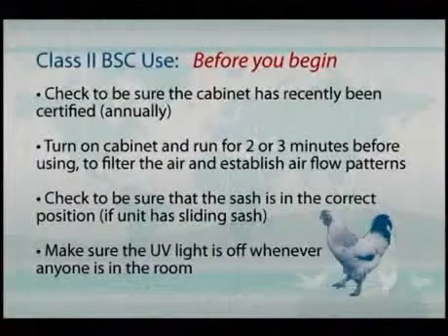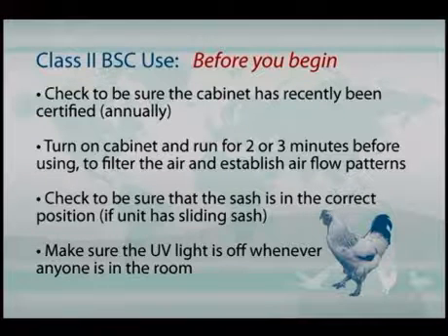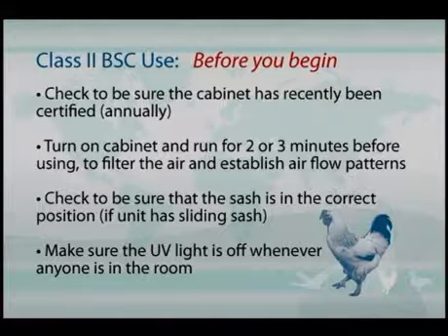The biological safety cabinet will only do as good a job as you allow it to do. You, the operator, have a lot of control over how effective this biological safety cabinet can be in containing the organisms that you're working on. And some of the things that you need to be aware of is that these cabinets need to be certified at least annually to make sure that they are operating properly and that the filters are not broken and allow the movement of infectious material through those filters. So that should be a standard operating procedure in your laboratory.